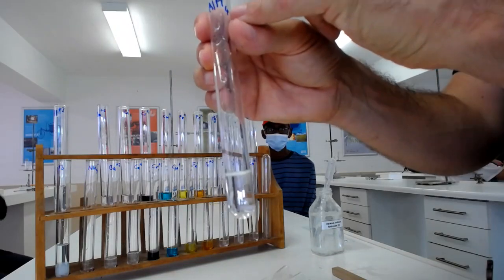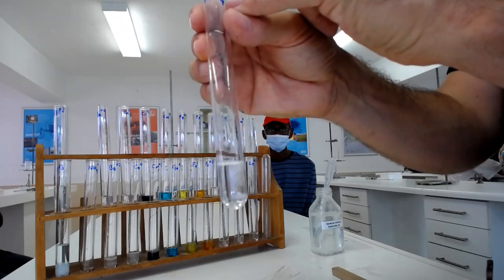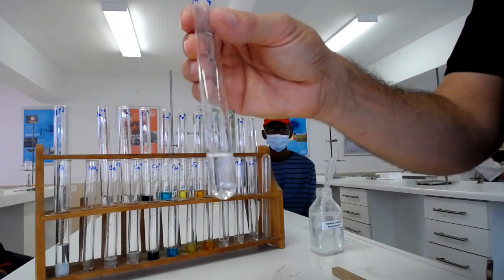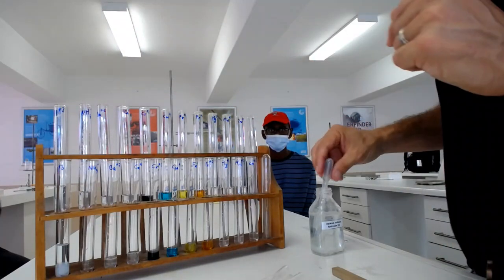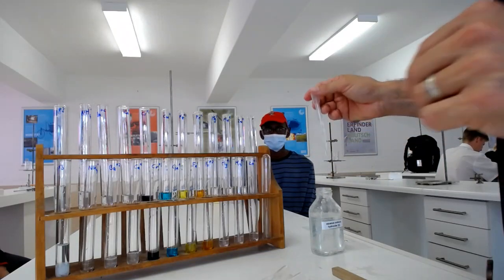Ammonia gas, is it acidic or basic? Basic. So how would we test for ammonia gas? Red litmus turning blue. Okay, so we're going to do that now when we light up our Bunsen burner.